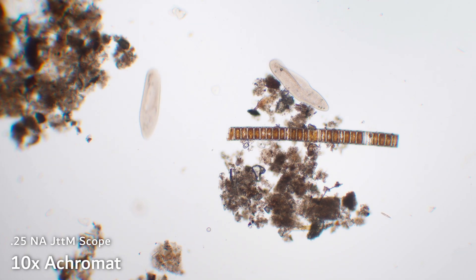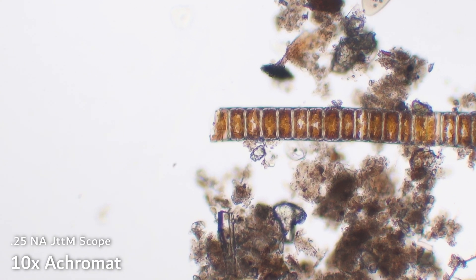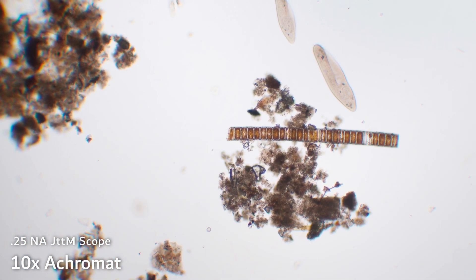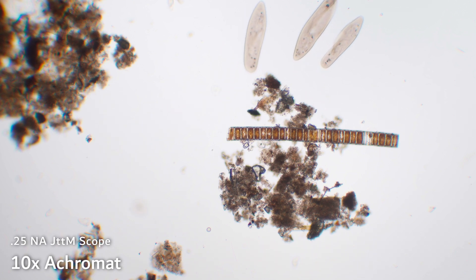This objective — what you can see is that in the middle, it looks great. These objectives are absolutely totally fine for normal viewing. They are pretty much the standard if you buy a microscope from $200 to $500 new, so a Swift or Amscope or Omax. These are the kind of objectives it's usually going to have. And what you'll notice is that when I get the center of this image nicely in focus, the periphery is blurred out. And that is a function of this objective not being corrected for field flatness. What's happening is the image that's being projected to the camera sensor right now is not flat — it exists in focus everywhere, but only on a spherical surface.